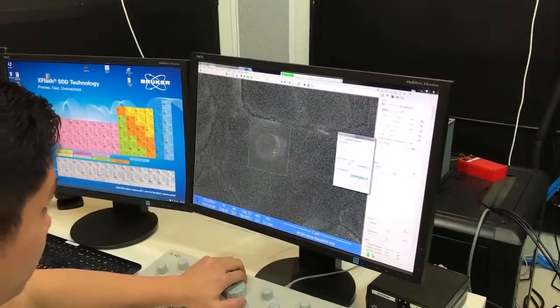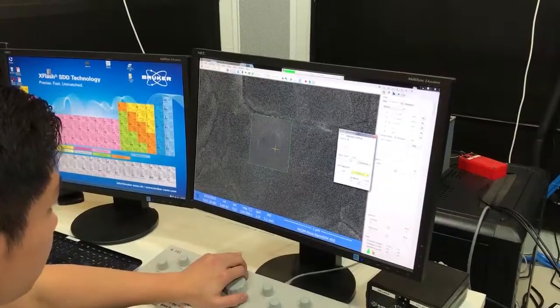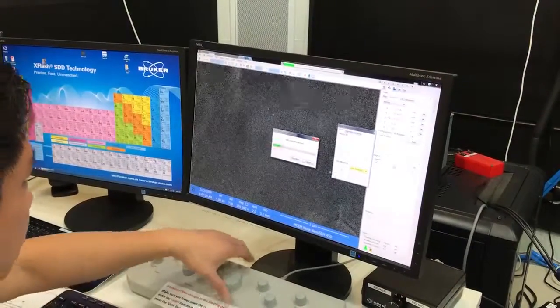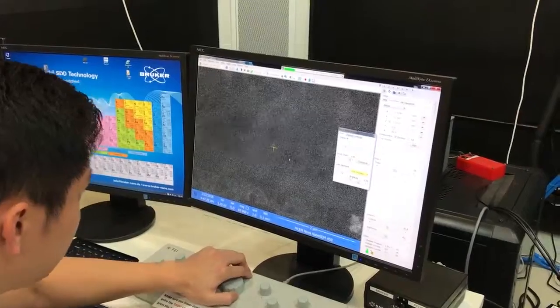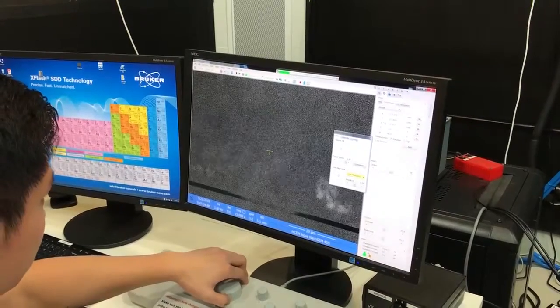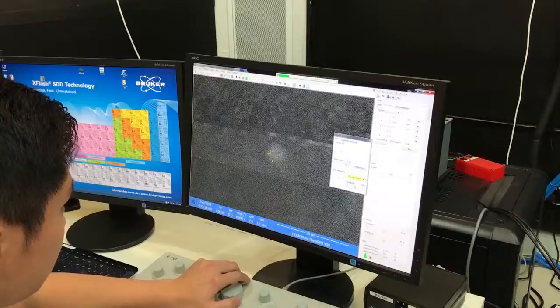So I was trying to do this again. So it's still there. Maybe try to bring out the contrast. Maybe just here.